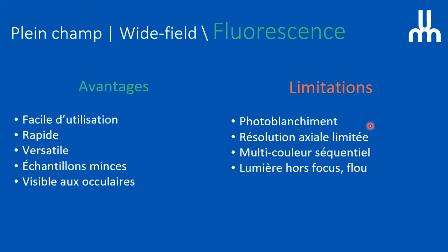The drawbacks are bleaching. I won't have a dedicated part on bleaching, but this is a very important component. It's just that we lack time. The axial resolution is limited. You cannot do multicolor on the wide field microscope at the same time unless you have different detectors. This is possible, but it requires having different detectors. And also there is a lot of blurriness because there is some light out of focus.